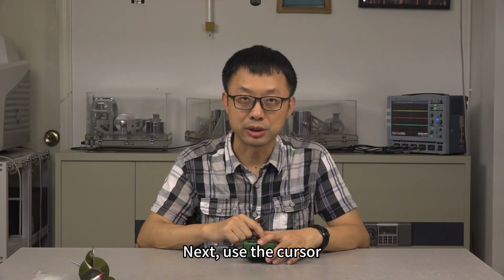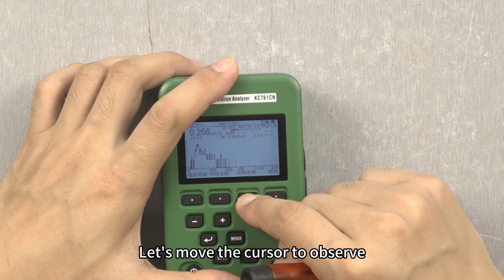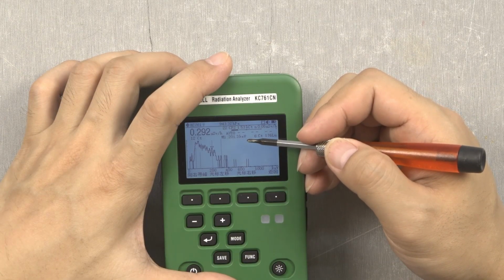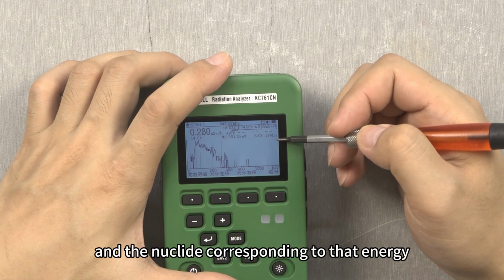Next, use the cursor, which includes peak finding and left drag cursor movement. Let's move the cursor to observe. Position the cursor here. The first number shows the cursor's energy, followed by the count rate at that position, and the nuclide corresponding to that energy.